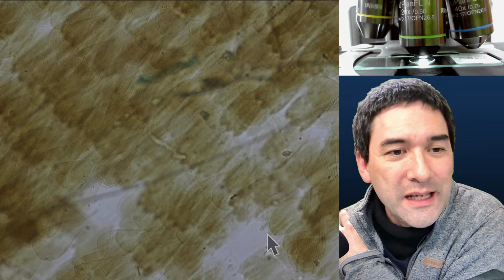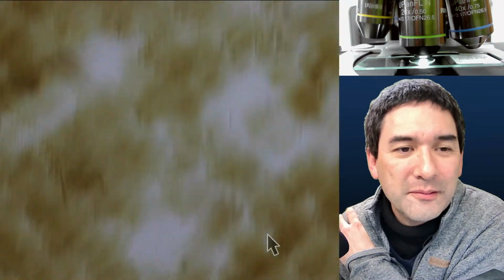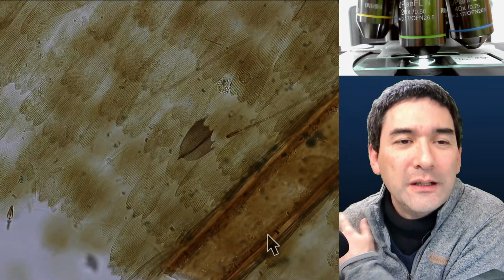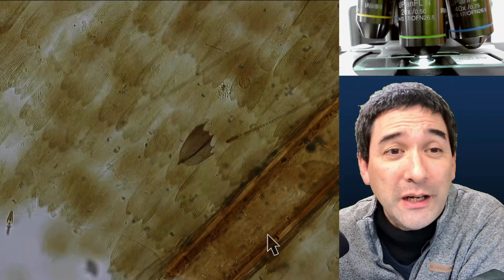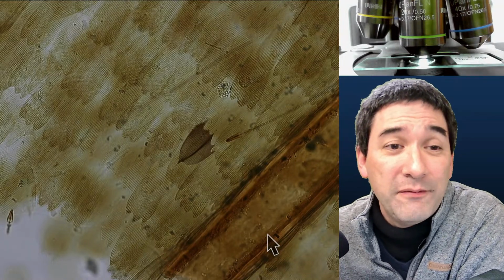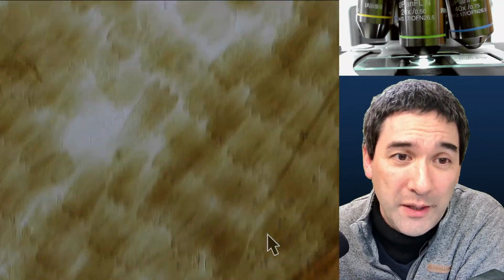And those scales are fairly large. Here, that's actually a nice one over here. And those scales can sometimes also be found in dust. So every now and then, when people observe something in dust or in water samples and find a scale like this, they wonder what could this be. In many cases, it's a scale of a butterfly wing.